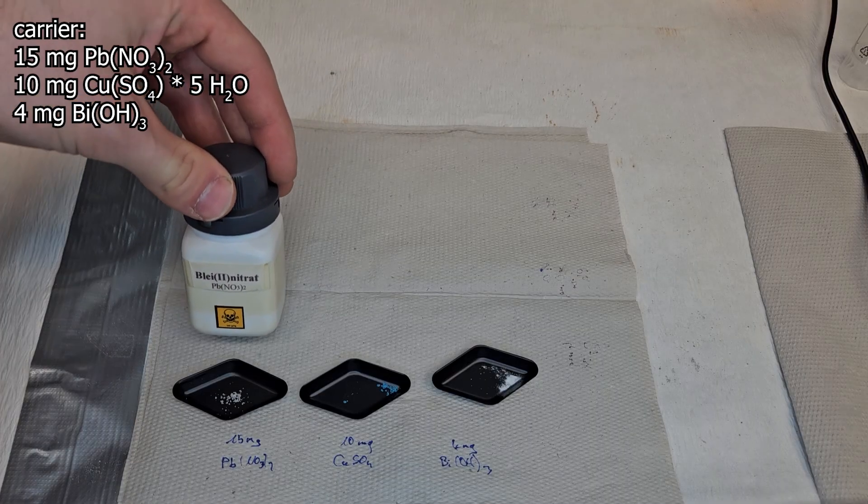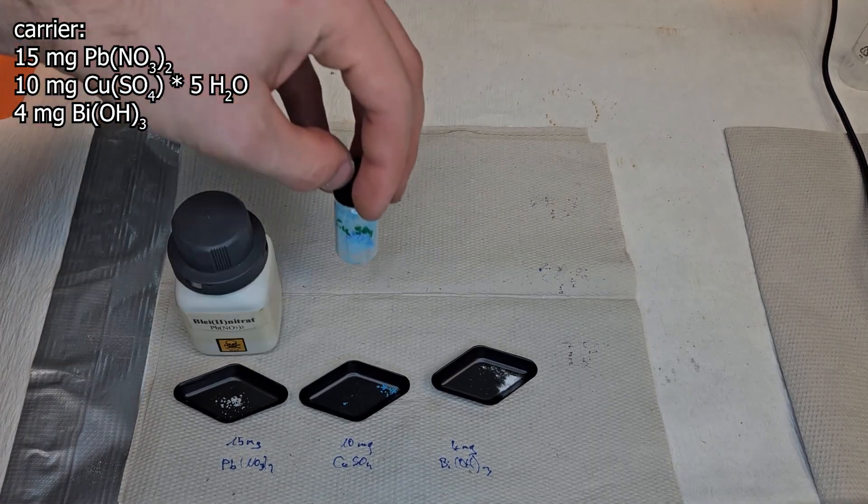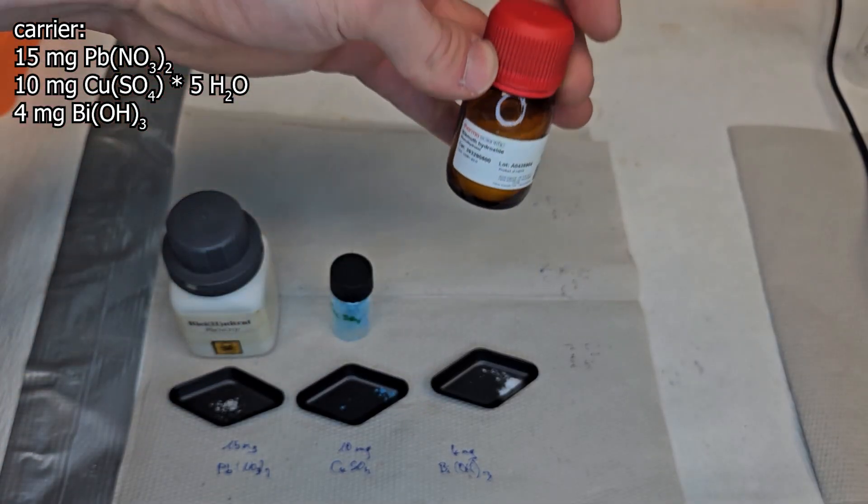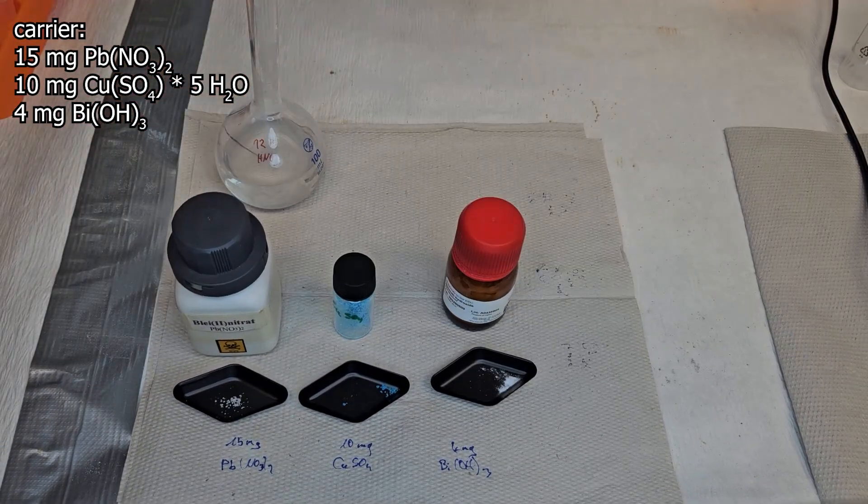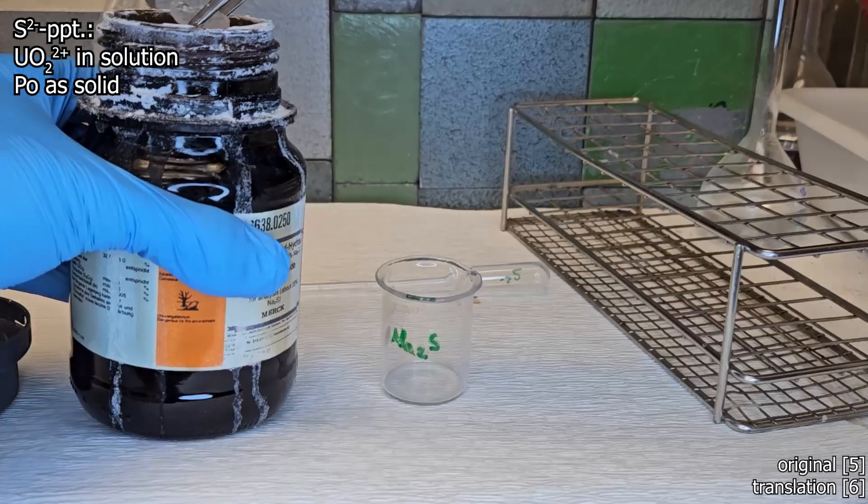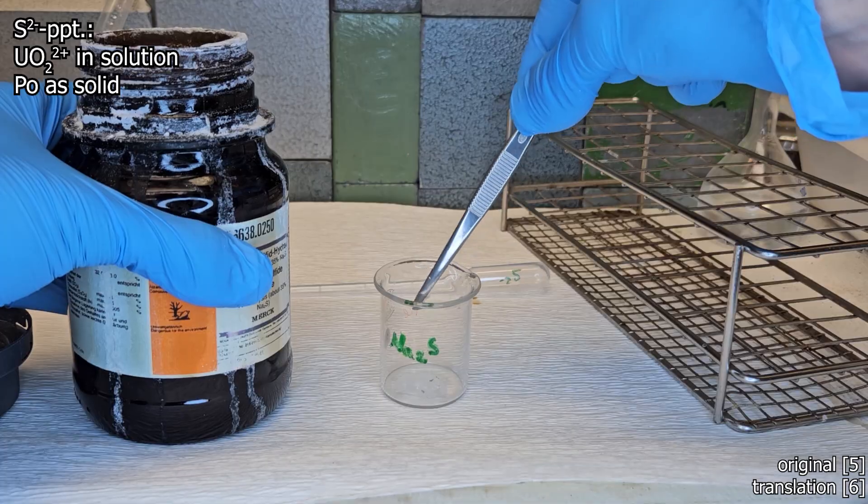The following carriers are now added to the solution for color effect: 15 milligrams of lead nitrate, 10 milligrams of copper sulfate, and 4 milligrams of bismuth hydroxide. The solution gradually turns slightly greenish due to copper. At that time, hydrogen sulfide was bubbled through.